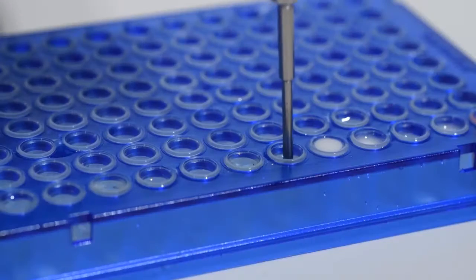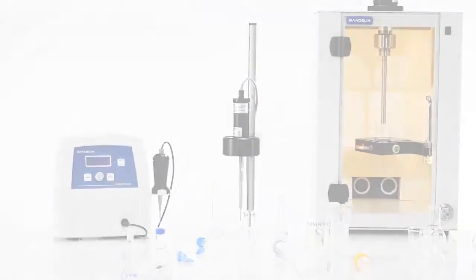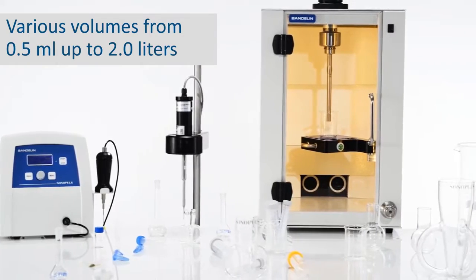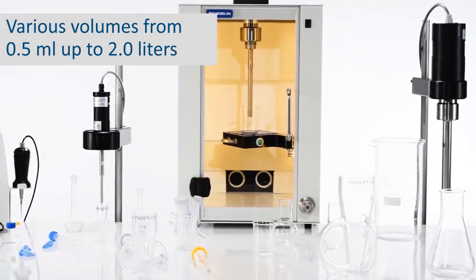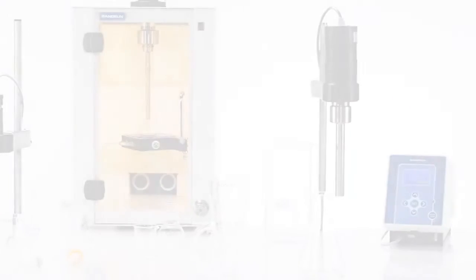Thanks to the Sonopulse Mini, even volumes in the microliter range can be treated. Ultrasonic technology has made the annoying process of decanting samples a thing of the past. There are ultrasonic devices available for all sample volumes, from Eppendorf tubes to falcon tubes to laboratory beakers that can hold up to 2.5 liters.